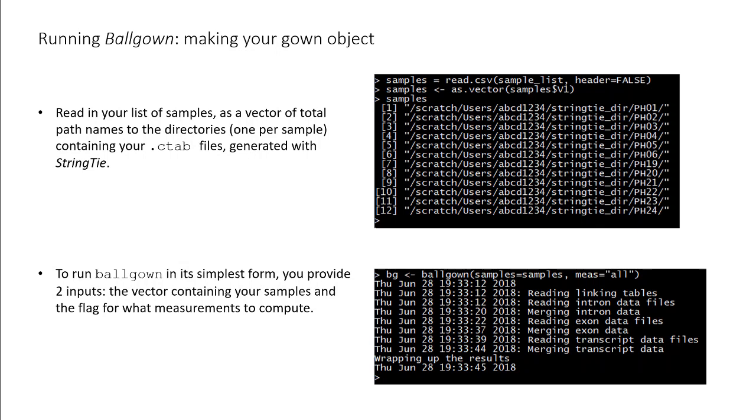Now, all we have to do is call the ballgown function with this list of directory paths as an input and specify the meas parameter, which indicates what to calculate. The output of the function is what's called a gown object, which we are assigning to the variable bg.